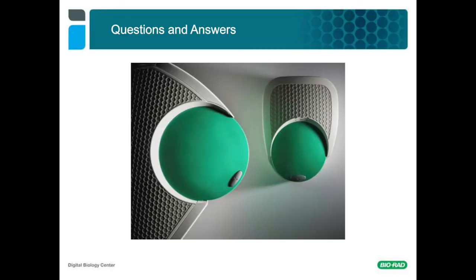So you could use FISH for sure to do some genomic arrangement studies, but FISH is not going to have the resolution that you would need to actually phase specific variants on a chromosome, just because a single probe is not going to fluoresce enough looking at a metaphase spread of cells. So you really need digital PCR to phase variants, whereas if you were looking at gross genomic structure that's not based on variants but instead on conserved sequences, you could use FISH.